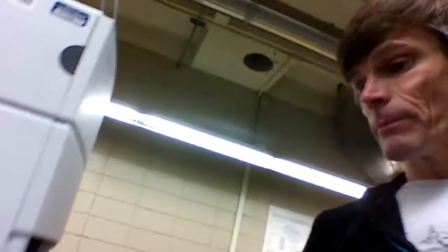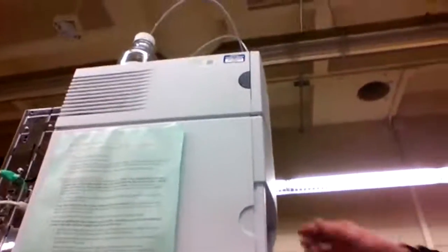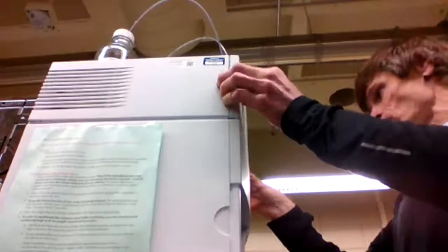And we also have an aqueous phase. Normally this is going to be a buffer at a particular pH that we run our experiment. So we have reservoirs with tubing that move into the instrument, and then a little further downfield, let's see if I can get this without breaking.